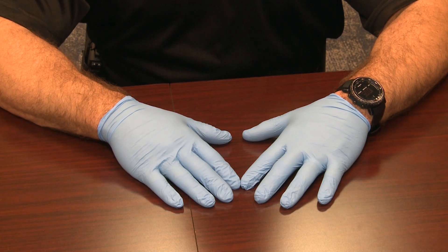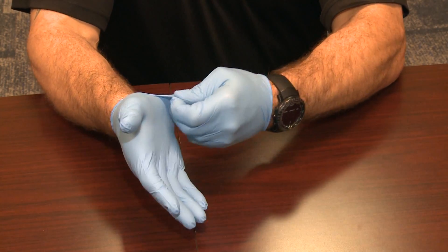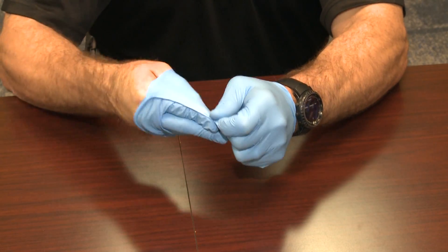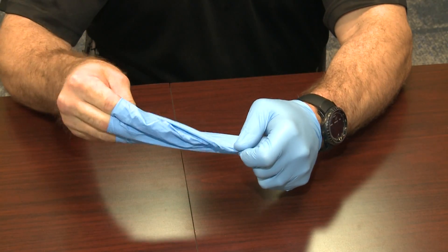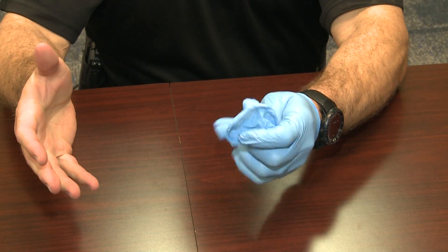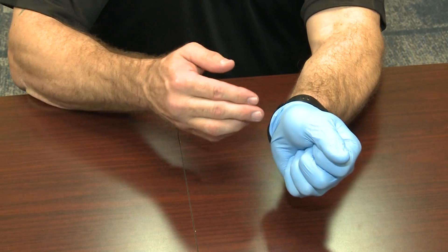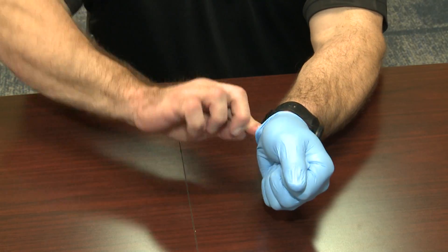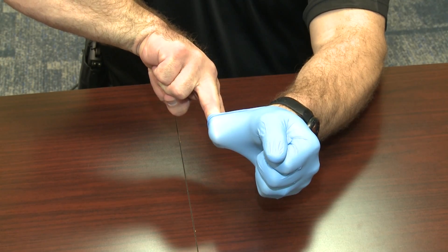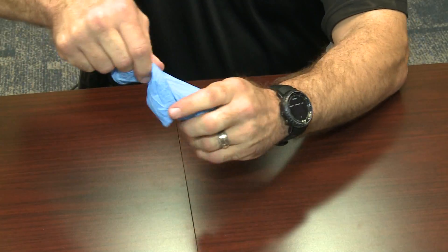Removal. Grab the outside or dirty part of the gloves with the opposite hand. Remove the glove inside out without spreading any contaminant. Place the removed glove into the palm of your opposite hand. Secure the inside of the gloved hand by going inside the cuff glove with two fingers. Remove the glove inside out, capturing the other glove, without spreading contaminant.